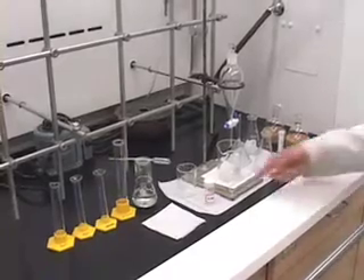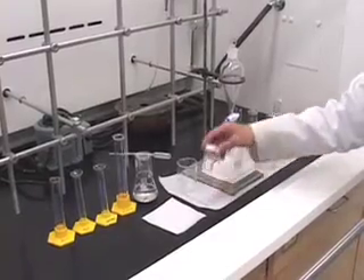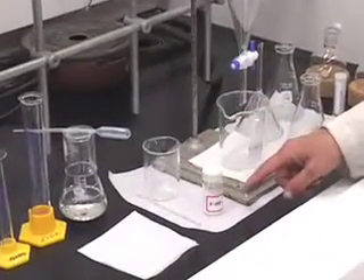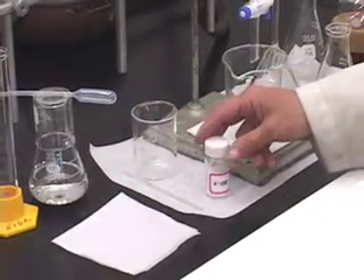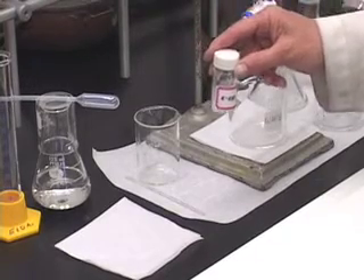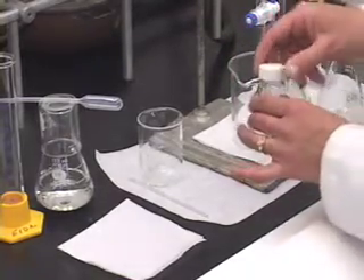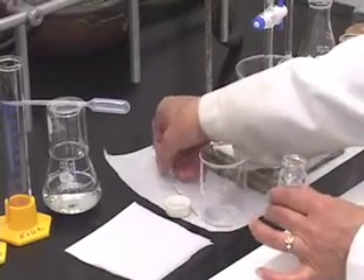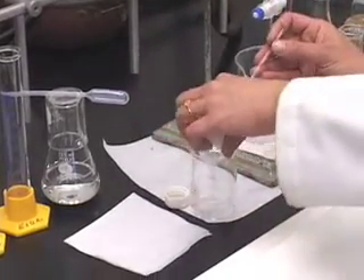Let us start separating the components of this unknown. First, you want this solid unknown to be in solution form. For that, we are going to dissolve it in ethyl acetate. What I would like you to do first is weigh this vial containing the unknown, note down the weight exactly to the fourth decimal place, and then transfer the contents of this vial to a 100 ml beaker.